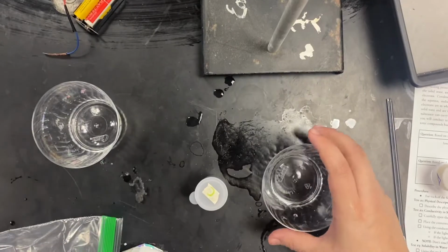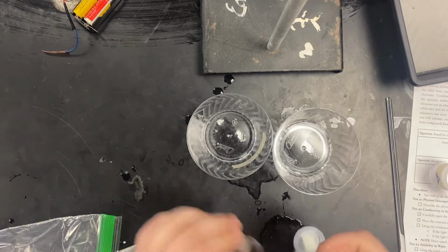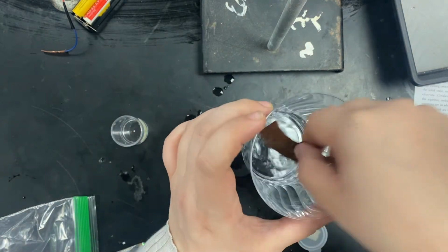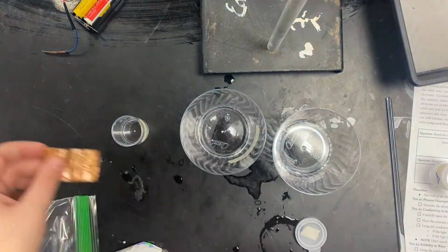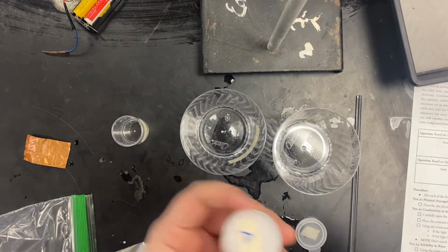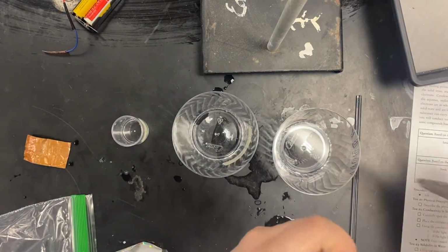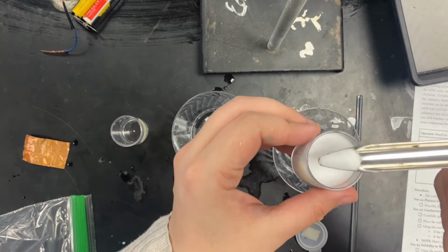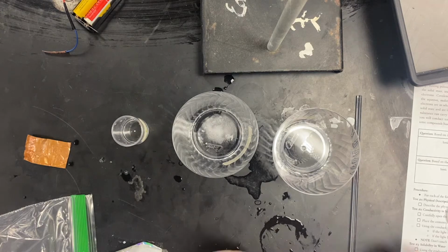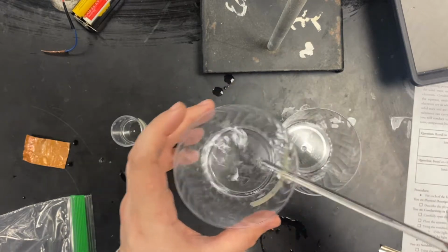Once that is done and you have your 2 cups, take sample C and throw it in the cup labeled C. Spoiler alert, nothing happens. You can take that off and dry it. What you're going to do then is take your scoop and take a small sample. Again, this is sample A. We're going to put it in cup A. A small scoop looks like this. Small amount. Dump that into A. Take your stirring rod and stir vigorously for about 30 seconds.